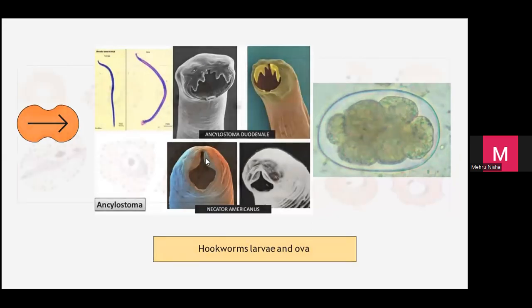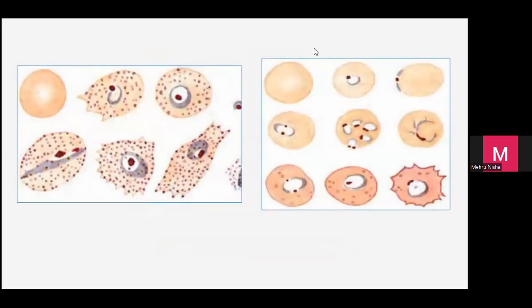So now, what about this? Now this one is malaria. Any idea what this is? If you look, the RBC is normal, this RBC is swollen, it looks bigger. This one looks uniform. So, okay, this one we call Plasmodium ovale.